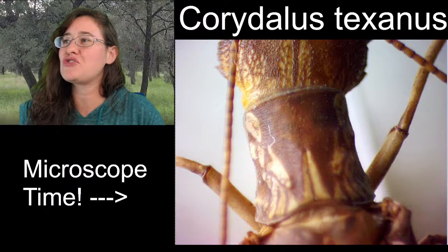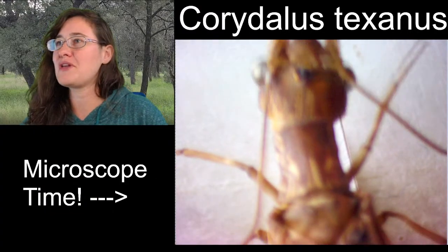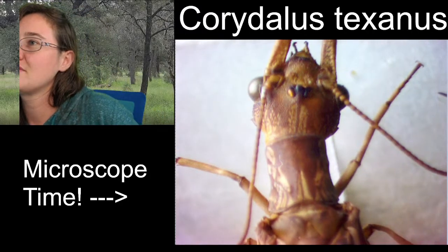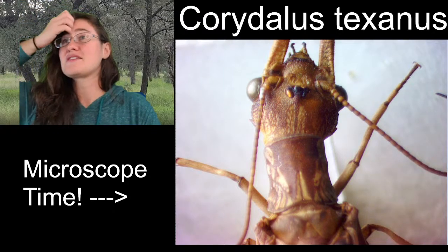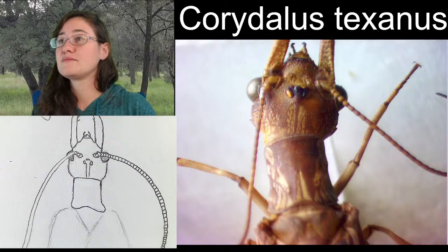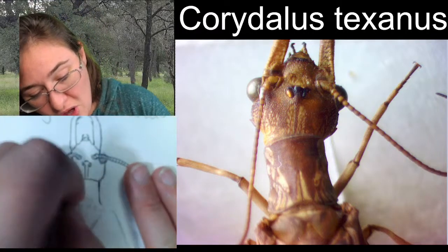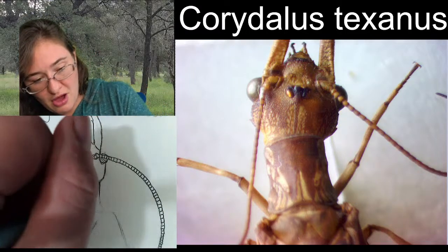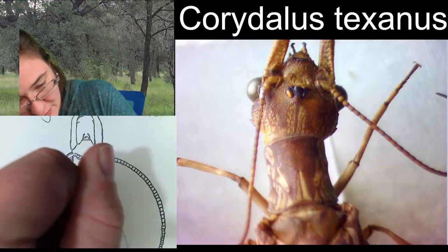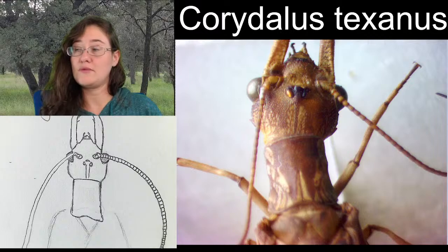I'm gonna zoom out really quick. I want to see the length of the pronotum because I think mine may not have been long enough. Yeah, look at how pretty that is. Very good. All right. I'm going to make my pronotum just a little bit longer. More like this. That's better.